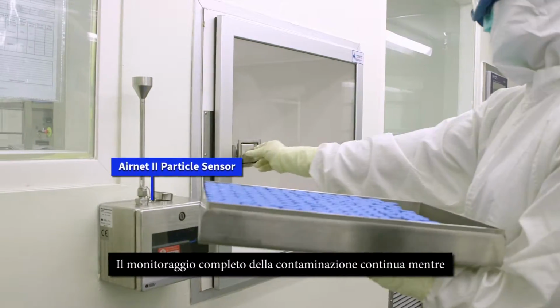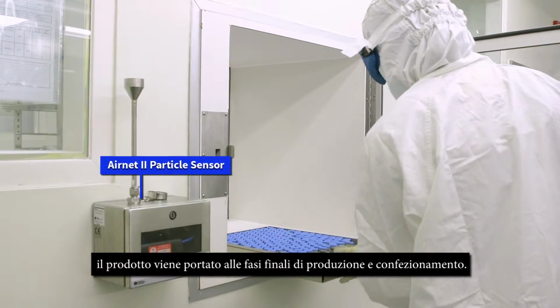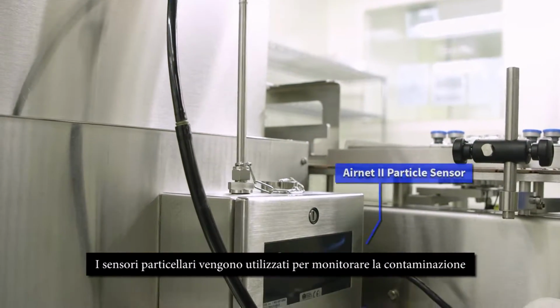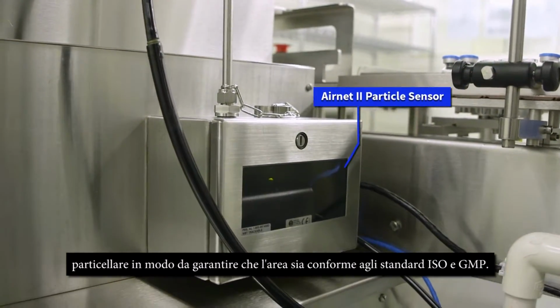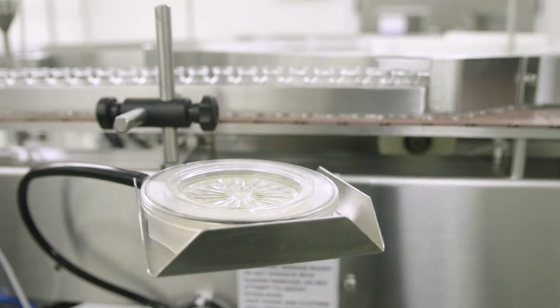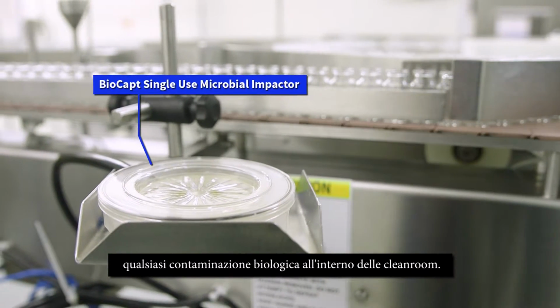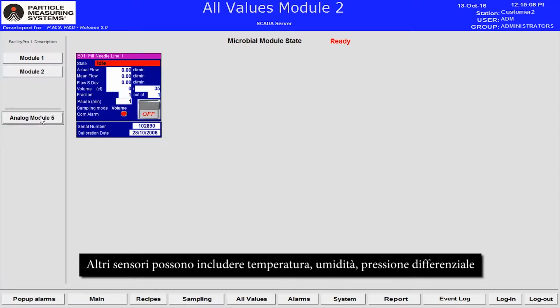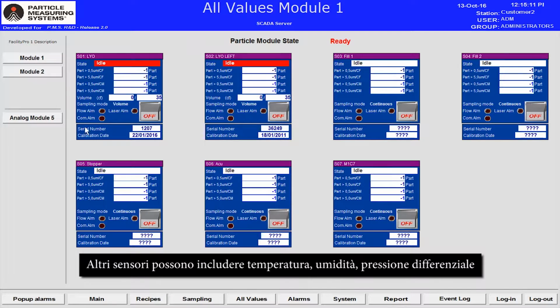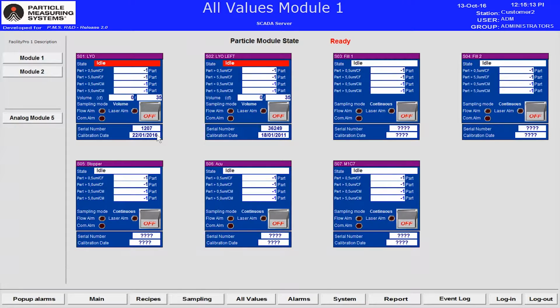Complete contamination monitoring continues while the product is moved on for final steps in manufacturing and packaging. Particle sensors are used to monitor for non-viable particulates to assure the area meets ISO and GMP standards. Microbial samplers are used to monitor for any biological activity in the clean room. Other sensors can include temperature, humidity, and pressure, as well as sensors to indicate activity in various controlled areas.